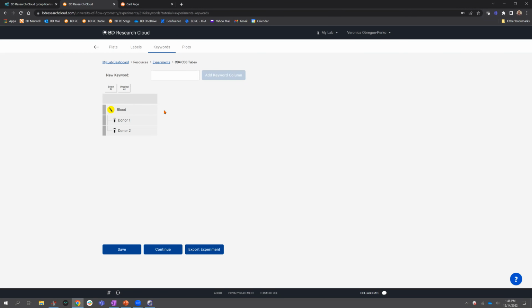For those of you that use FlowJo a lot, you can add keywords in FlowJo, but they don't become inherent to the file itself. It's really just kind of a display in FlowJo, right? So good practice is to maybe annotate as much as you'd like to on the actual file. And that way there's never any question of what that file is or where it came from.